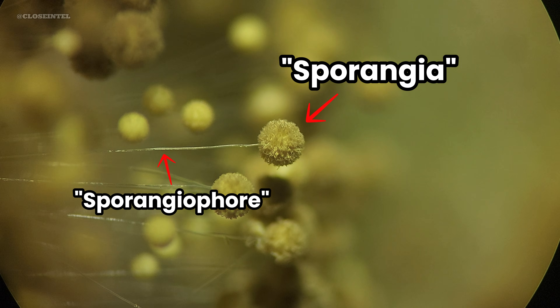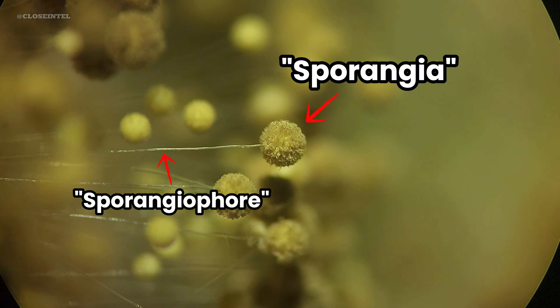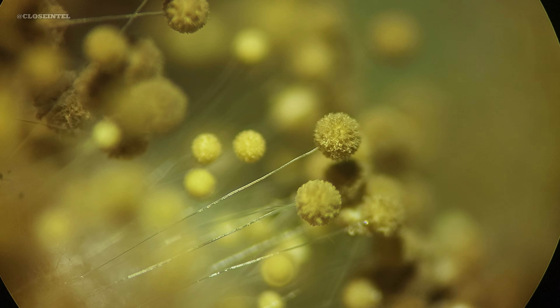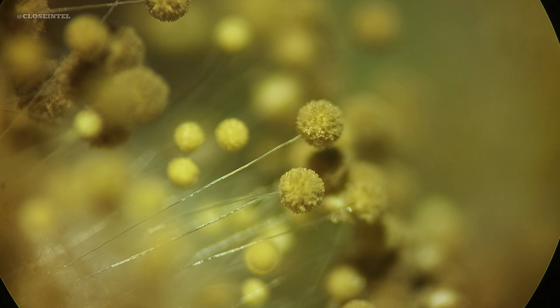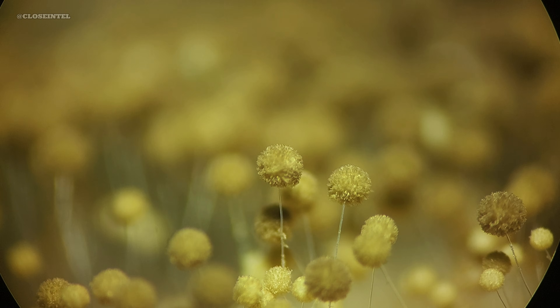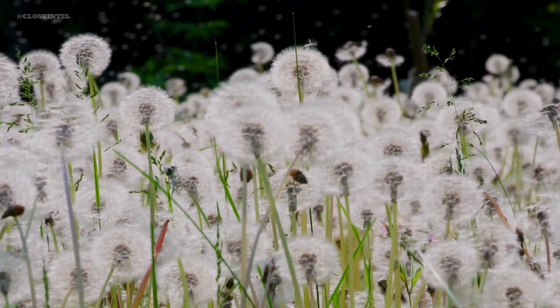Sporangia are part of their reproductive cycle, each one filled with spores ready for dispersal. Think of sporangia as tiny balloons sitting on top of slender sticks, where each balloon is packed with spores ready to pop and spread out like dandelion seeds in the wind.